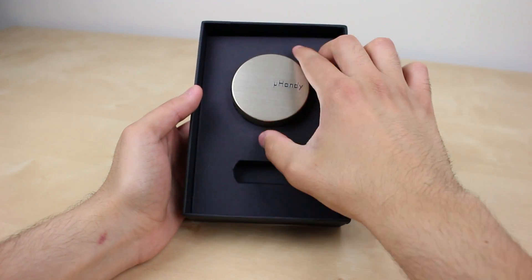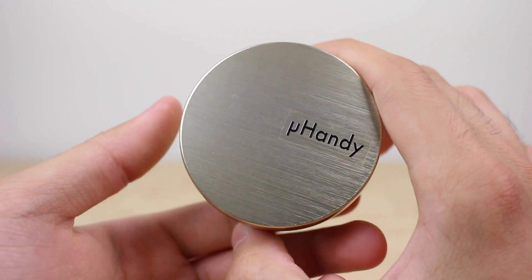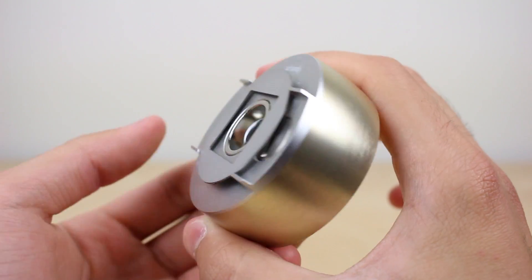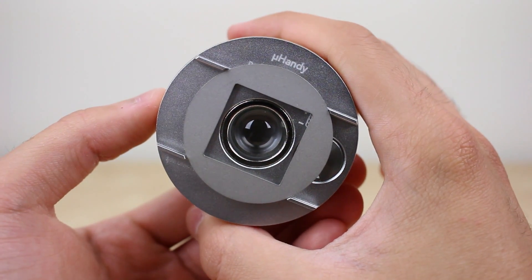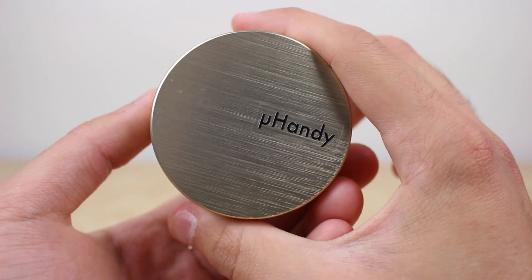As for the stage itself, it comes in the standard gold color. It is made out of aluminum but it is surprisingly very light, which is a good thing considering that it will be attached to the camera of your phone. Basically this component will hold what you want to observe and turn on a light to view it with your camera.